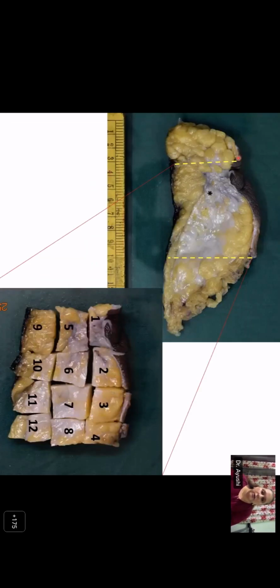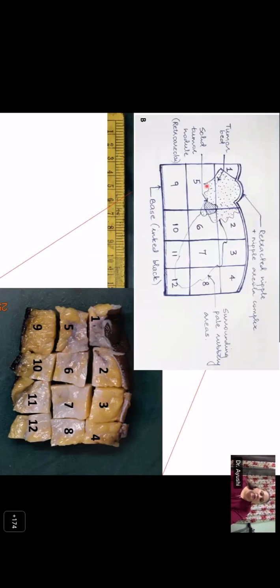So this is one slice of the post-chemotherapy specimen in which a small nodular concentric area of the tumor was identified with surrounding fibrosis. So the whole fibrotic area is submitted because if we have a buckshot pattern, the microscopic extent of the tumor can be much bigger than what we are seeing on the gross examination. So we submit the whole grid, including whatever grossly identified tumor and the surrounding area of fibrosis, and we make a grid diagram in which these representative sections are labeled with the orientation to the overlying margins or base or skin. Now, how much of the tissue to sample?